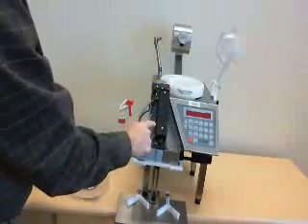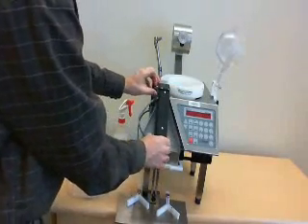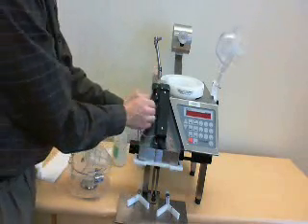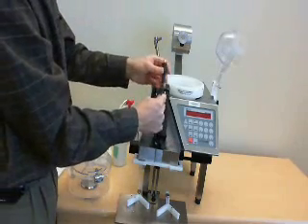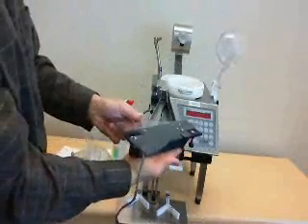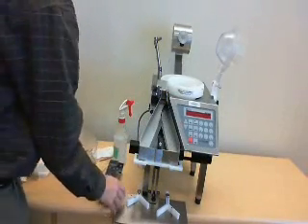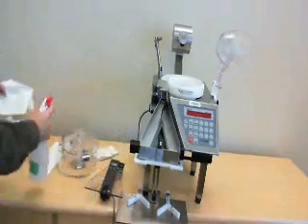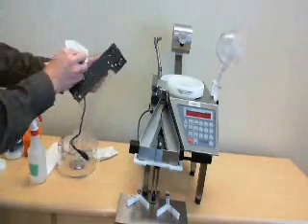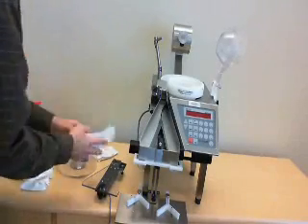Now we will clean the counting sensors and the pill path area. We're going to start with removing the two thumb screws of the cover of the counting sensor, and also gently remove this electronic component. We're going to always place this on its back on a flat, clean surface, so we do not scratch the surface. Cleaning solution. Clean this section off that can be exposed to tablet dust. Clean and dry as you go.